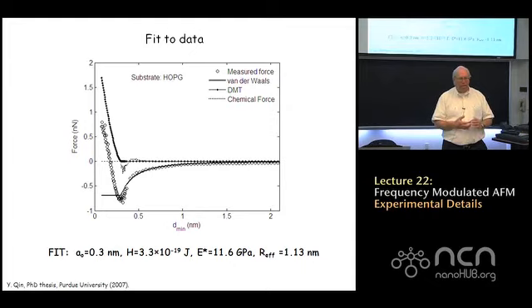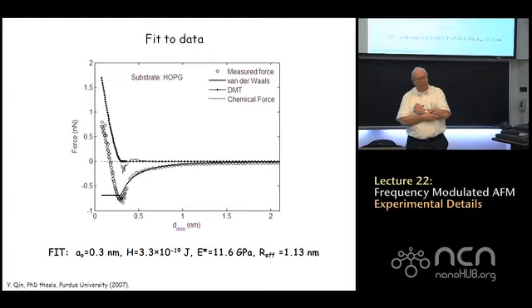Ultra-high vacuum, I think, is technically defined as anything below 10 to the minus 9 torr, but if you can get 10 to the minus 9, you can usually get 10 to the minus 10. So 10 to the minus 10 is a good pressure to be. And these tuning forks are great because they are compatible with ultra-high vacuum.